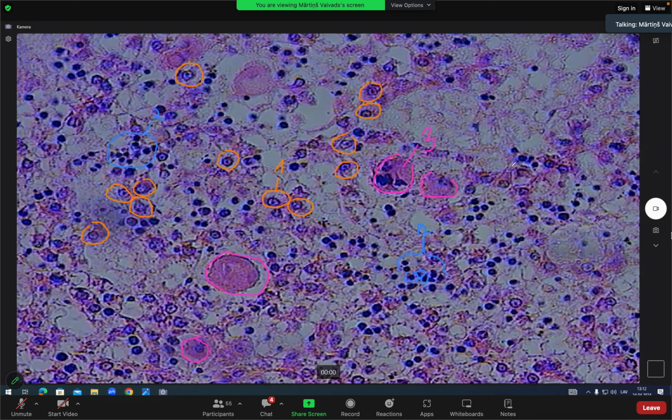Those are not structures that could be asked here. There are some already developed blood cells, big sinusoids are forming, but you don't need to label blood vessels. Only these 3 cell types. So hepatocytes, that's number 1. Hematopoietic islands, that's number 2. And number 3, megakaryocytes. I hope you got this, yeah?